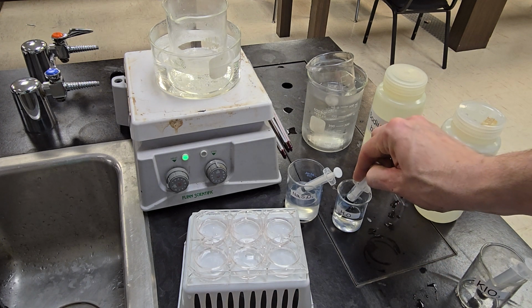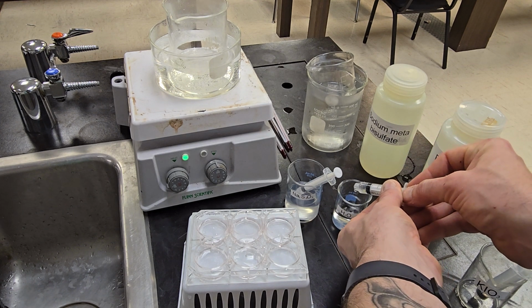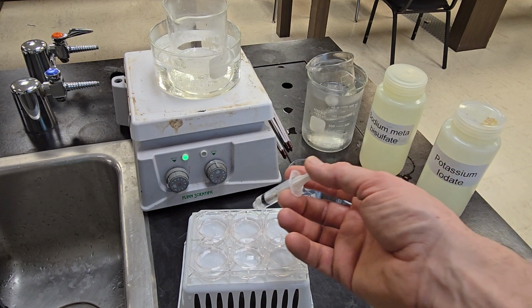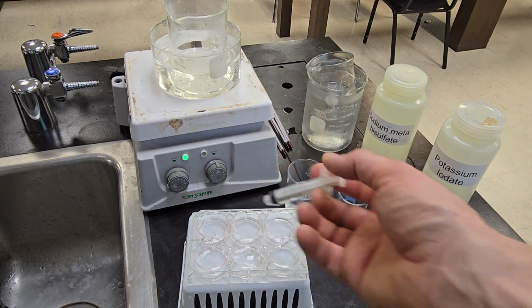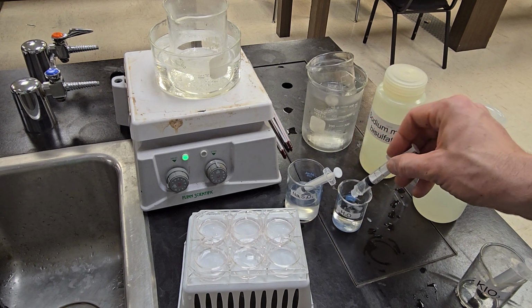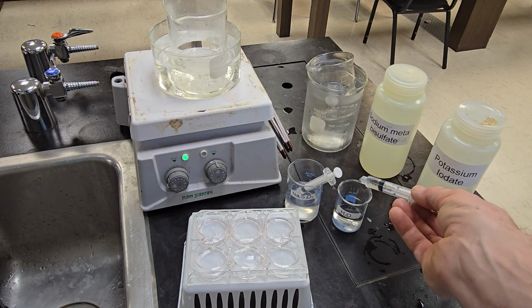Now my first plate, if you read the directions, says that it has no water. It's pure potassium iodate. Second plate has 1 milliliter of water, so here's 1. That makes it a total of 5 milliliters. Every plate has a total of 5 milliliters of liquid. The ratio of potassium iodate to water is what changes.